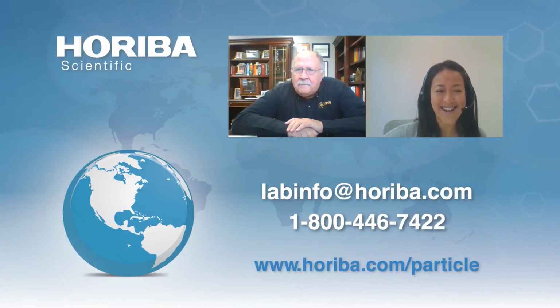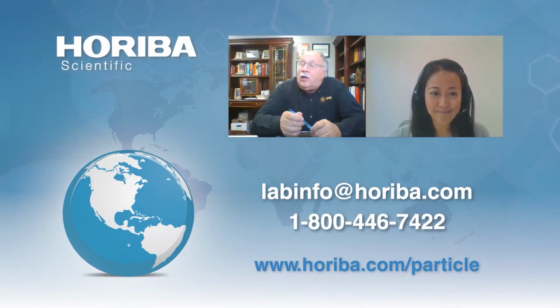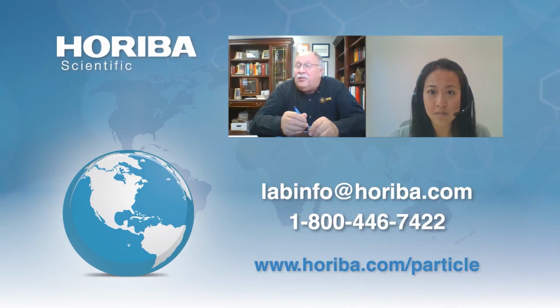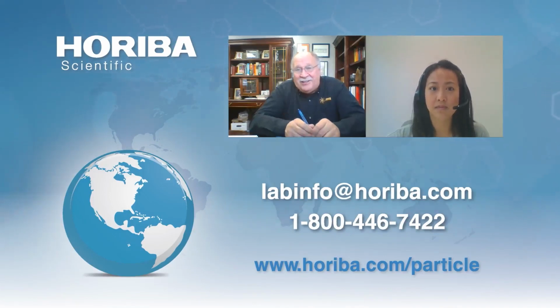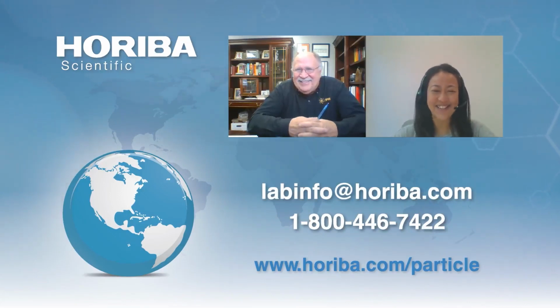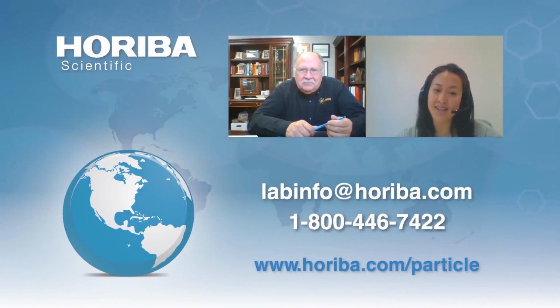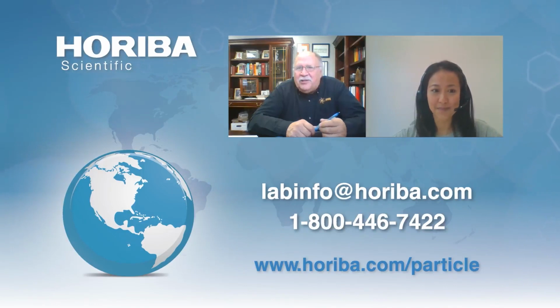Is there any concluding comment that you would like to add, Willie? No, this is a complicated area. Please bear in mind, you can't run enough particle size measurements, or enough characterization measurements. You'll go out and abuse your analytical departments. That's what I say. Yes, for sure. And sometimes that means submitting samples to HORIBA Instruments, where we have a suite of different technologies, or maybe to AVEKA, just to see from a different perspective what exactly you're working with, what exactly the particle challenge is. Sometimes that's what you need, another set of eyes.